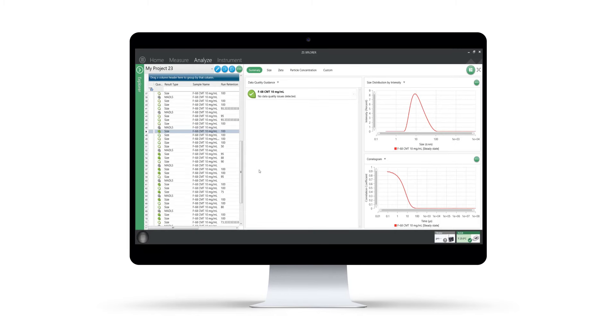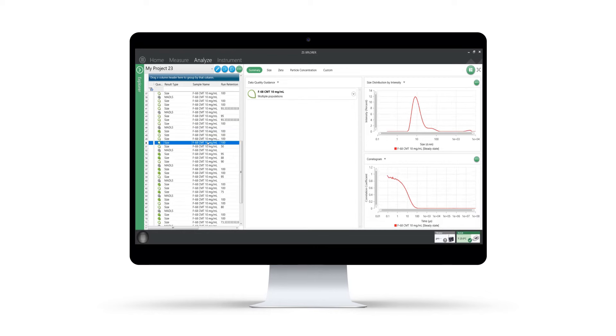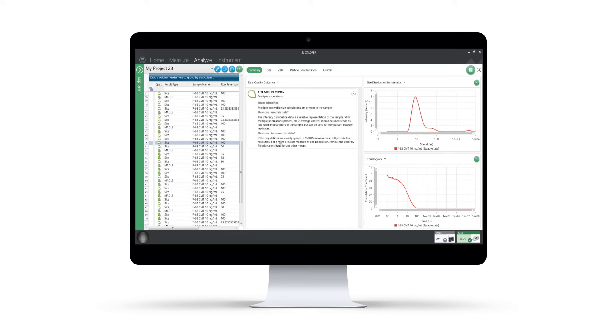The ZS Explorer software also employs an artificial intelligence-led approach to data quality assessment, which helps you get the best possible results from your sample. It subtly brings your attention to any potential measurement issues and provides clear guidance on how they might be improved.